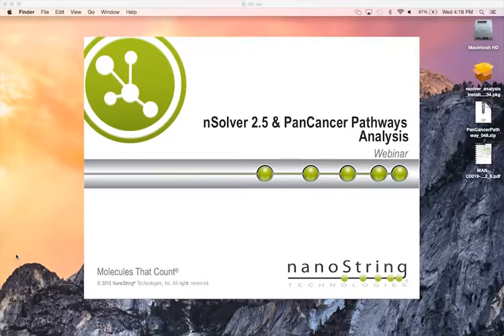Hi, in this short webinar, I'd just like to introduce you to the requirements to install nSolver version 2.5 and the advanced analysis on the Mac operating system. So advanced analyses are a new kind of sample analysis introduced in nSolver 2.5.